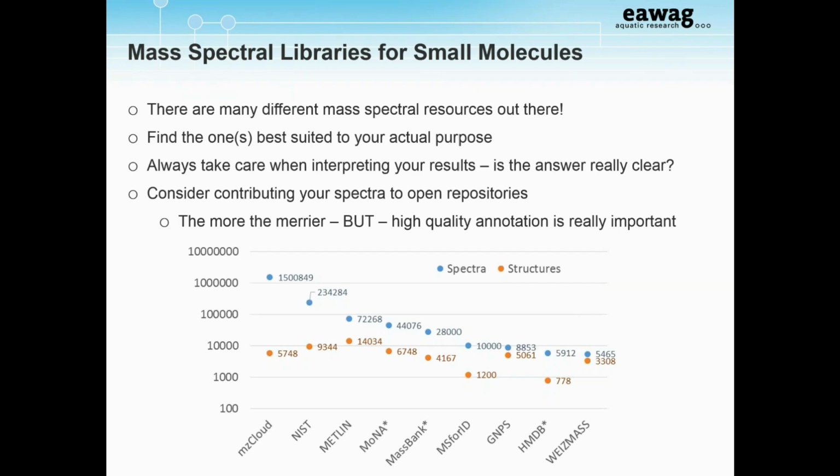So this question relates to that. Are there LCMS-specific databases where RT information is recorded? Yes. So, for instance, in MassBank, not all of the records have retention information, but the vast majority, in fact, all of the ones processed with our MassBank do have retention time information, not retention index, sorry. So they have retention times, and they also have the reported chromatography.